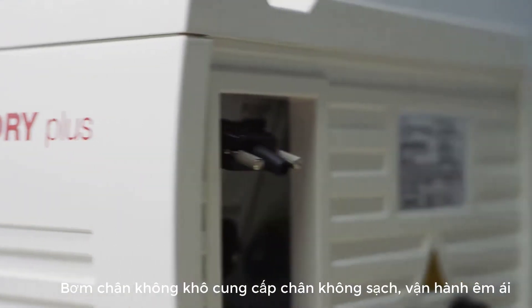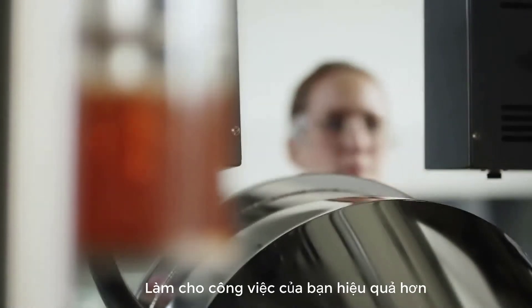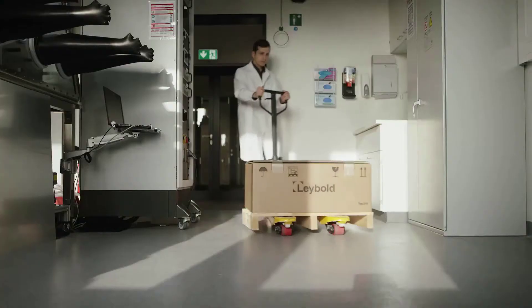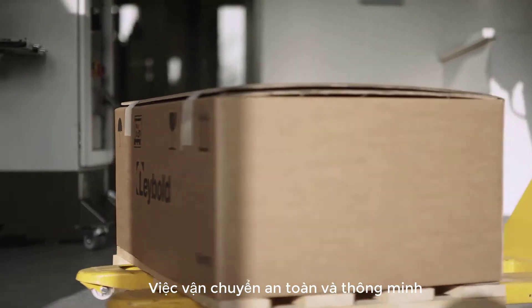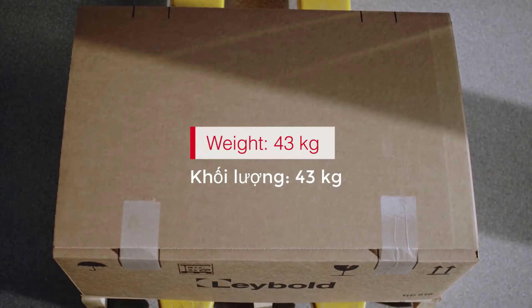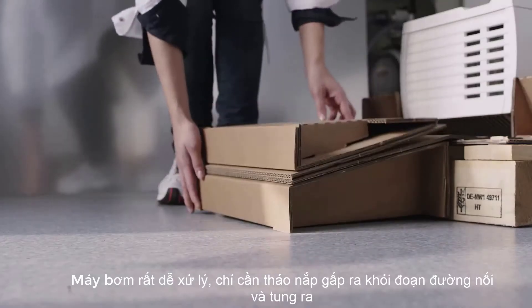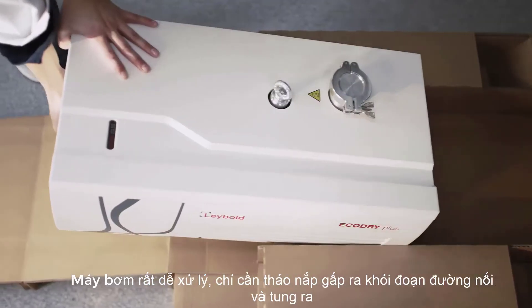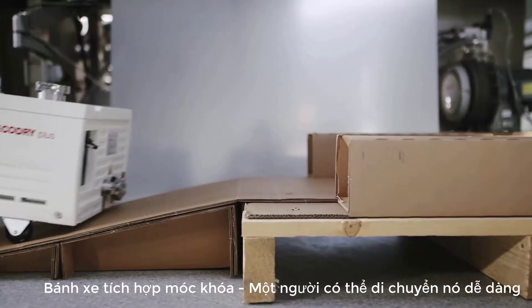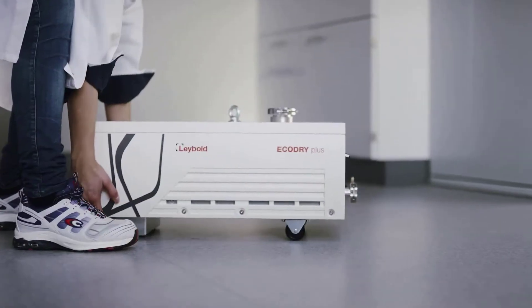The new Eco Dry Plus — the quietest vacuum pump in its class — makes your work more pleasant than ever. Here's how it is delivered: securely and cleverly packaged, weighing only 43 kilograms, this pump is easy to handle. Simply remove the lid, fold out the ramp, and roll out the pump, gliding on integrated wheels. The Eco Dry Plus is right where you need it, and one person can move it around easily.